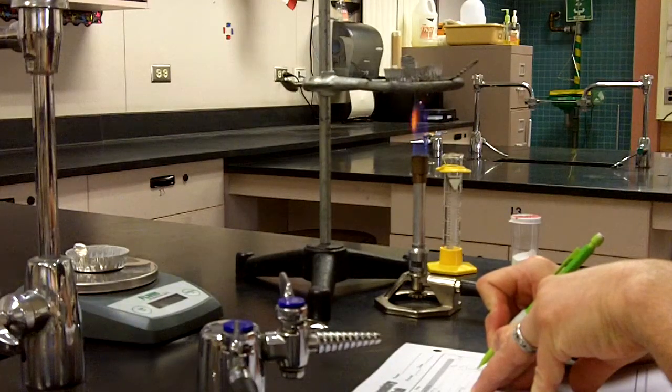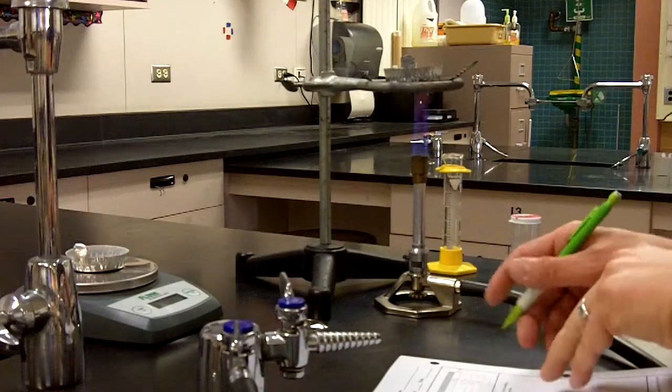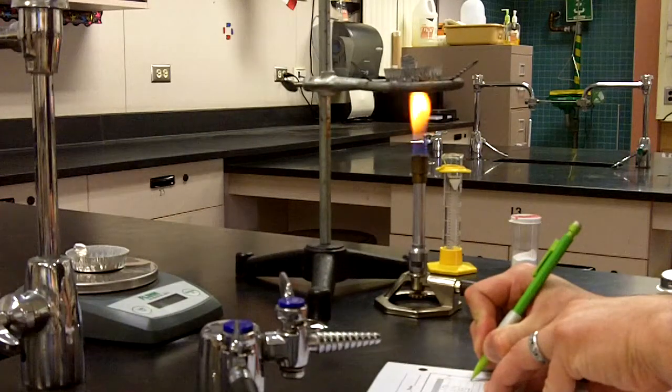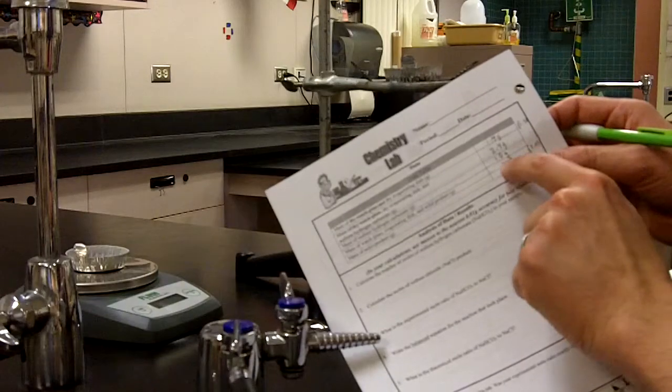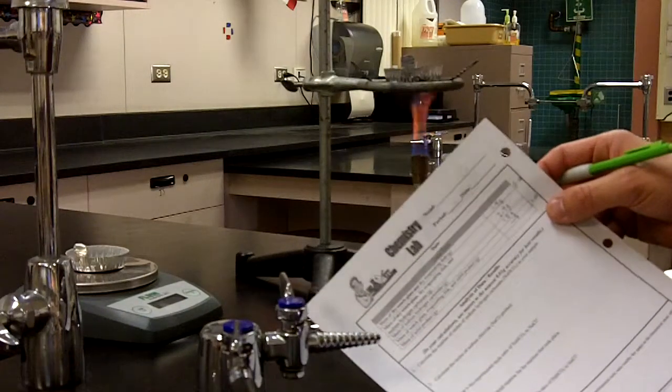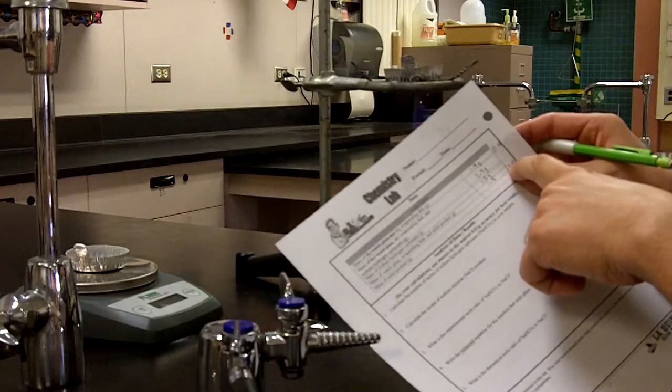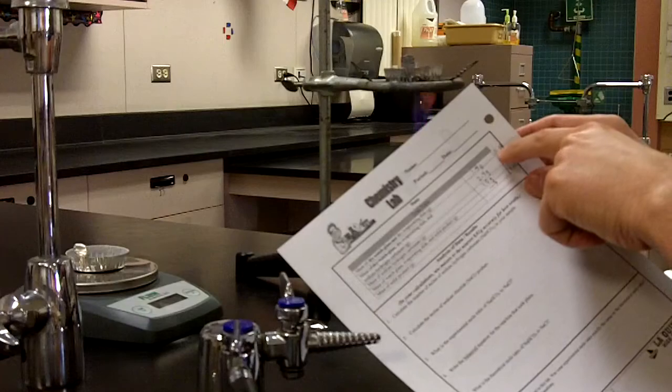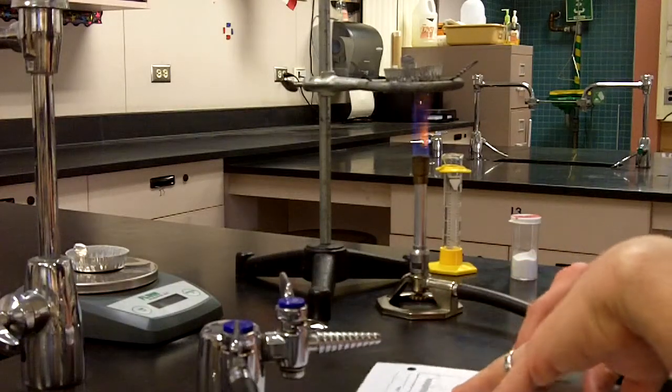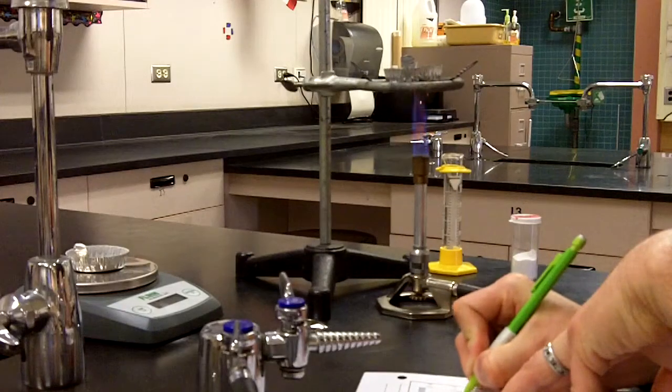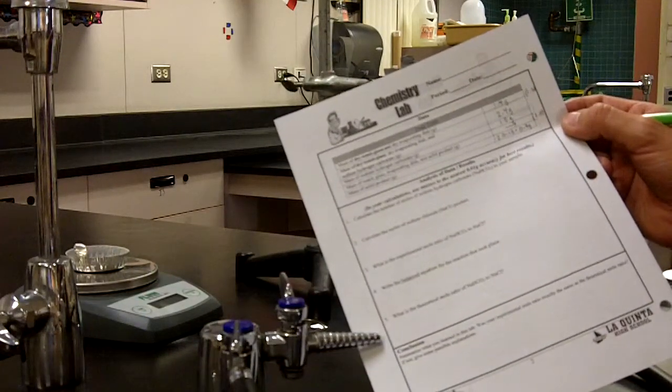Then write down the mass of the watch glass evaporating dish and solid product. Please write an arrow pointing to the right inside the space there to indicate that we have the second material used from a previous run of the experiment, and write that down as 2.0, put that in parentheses as well. So the 1.3 after the 1.4, and the 2.0 after the arrow. Now we need to figure out how much the mass is for the solid product itself. If the evaporating dish and the solid product is 2.0, and that first unused evaporating dish was 1.3, we take the difference: 2.0 minus 1.3 gives us 0.7 grams. And that 0.7 grams is the ideal number that we were expecting for this lab.